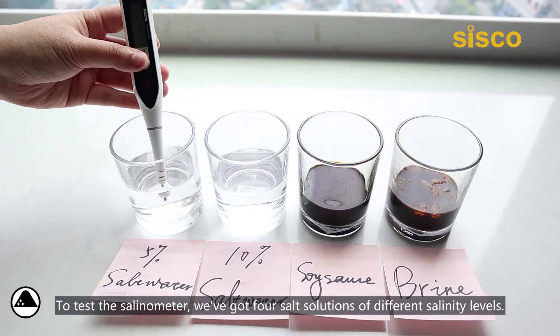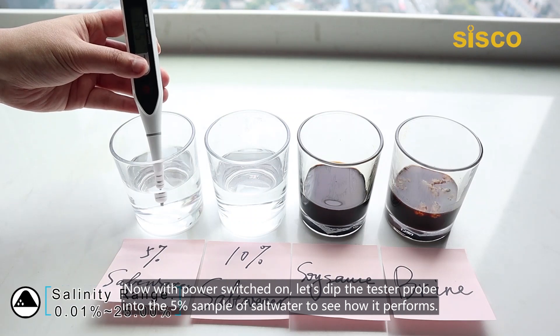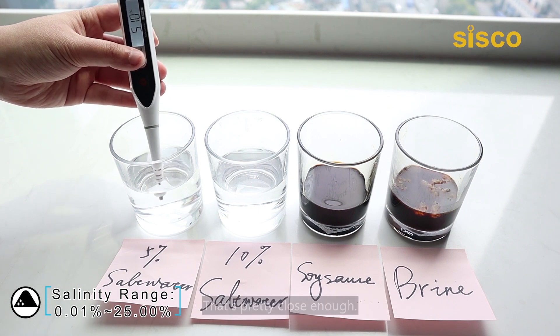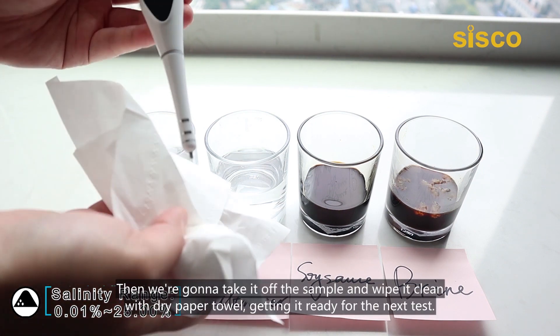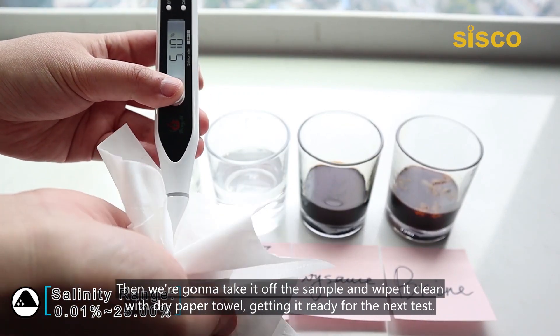To test the salinometer, we've got four salt solutions of different salinity levels. Now with power switched on, let's dip the tester probe into a 5% sample of salt water to see how it performs. Now it gives us a stable reading. It shows 5.10% — that's pretty close enough. Then we're going to take it off the sample and wipe it clean with a dry paper towel, getting it ready for the next test.